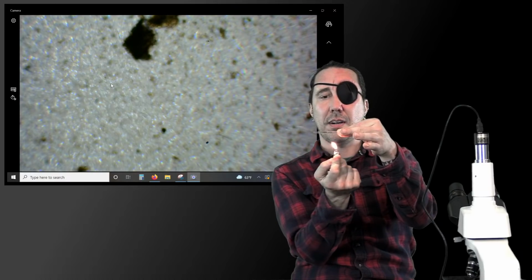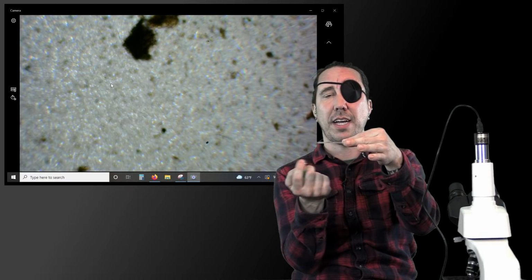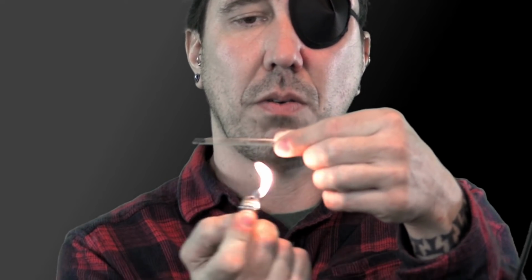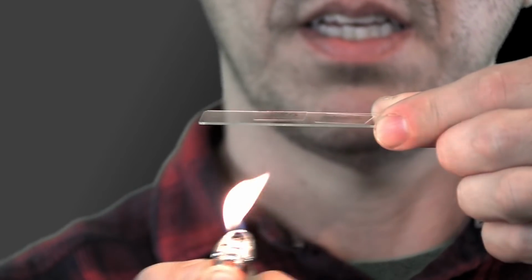So we want to light the lighter. I usually just try to count to 10, and I'll do it in increments. I'll try 10 and stick it back underneath there, and then if the nematode's still moving too much, then I'll do it again. You don't want to hold the flame too close to the glass because you're going to get the soot from the burn stuck to the glass. You want to keep it down some. So just keep it moving, and keep your flame right up where the flame's touching the glass. Like that. That's about a 10 count.